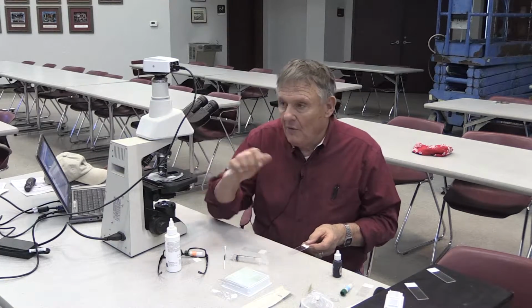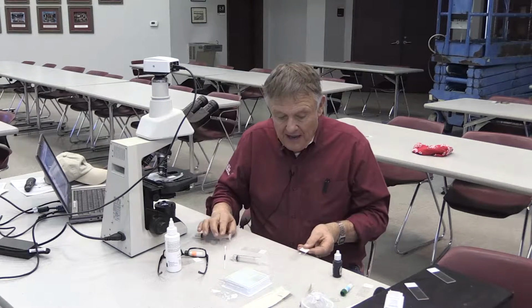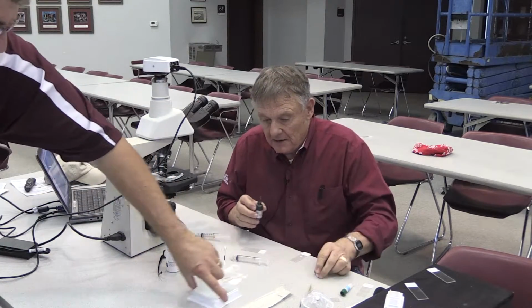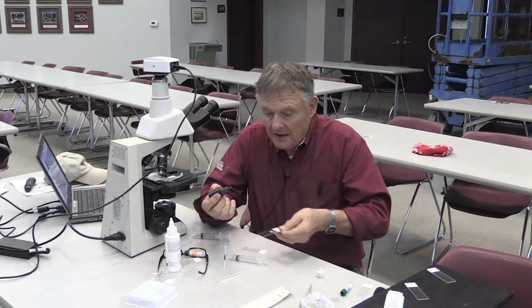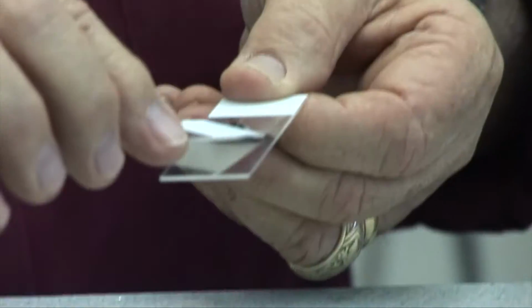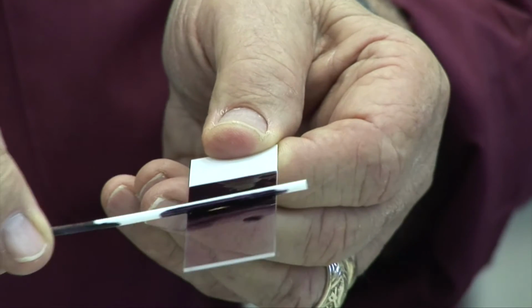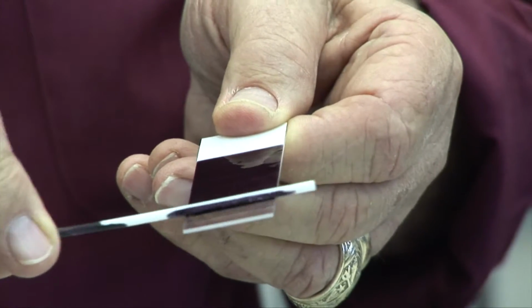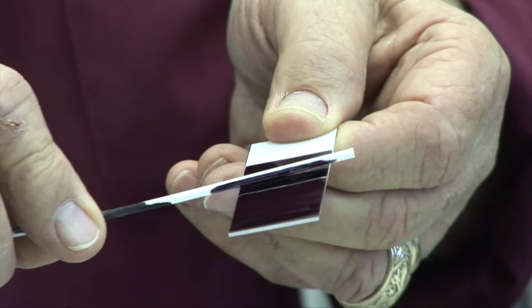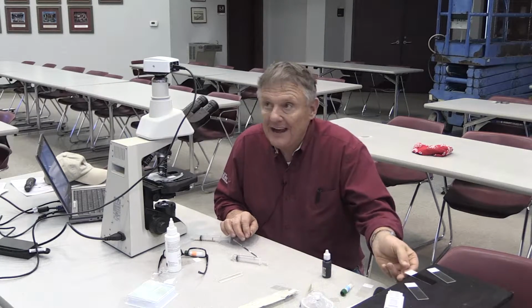So basically what I want to do is take a very, very small drop of that semen and put it on a slide, and then a very, very small drop of stain. Now, what a lot of people do is take a little wooden stirring rod and mix those together. What you're trying to do in staining is make thicker and thinner places in the stain. That way you're going to get a better look at several different fields. Then once you get that stained, you need to let it dry well.